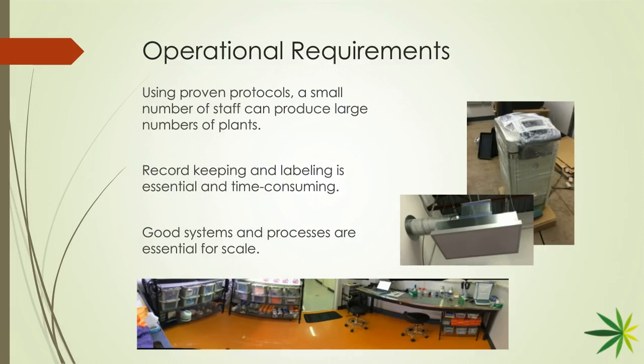This person is asking, with cloning, we know that we always are going to get the same plants. With micropropagation, is it the same, or can we have a problem with the genetics? And as I want to explain to them, and you can explain in detail more, micropropagation is just basically traditional cloning taken down to a little smaller part of the plant. Exactly. Right? So it's no different than a regular cloning process. So nothing changes, right? Not when you're doing this method.